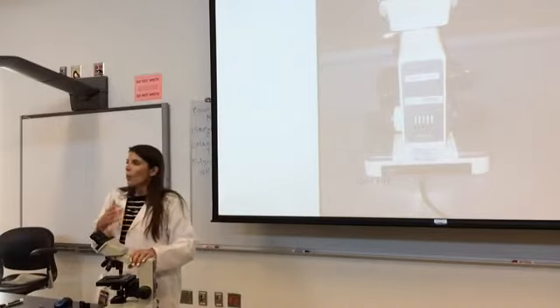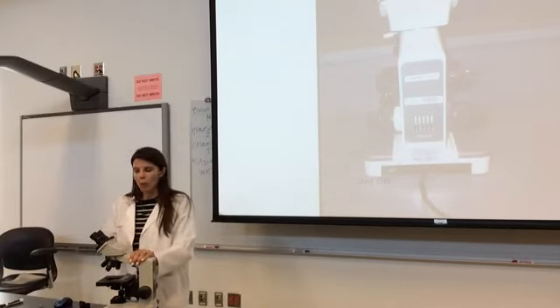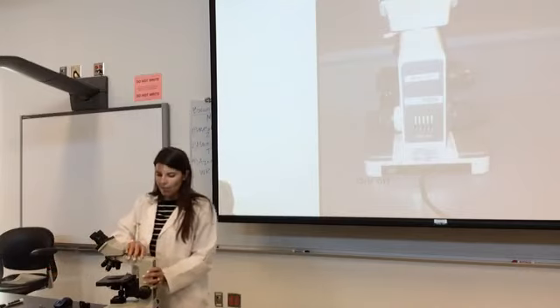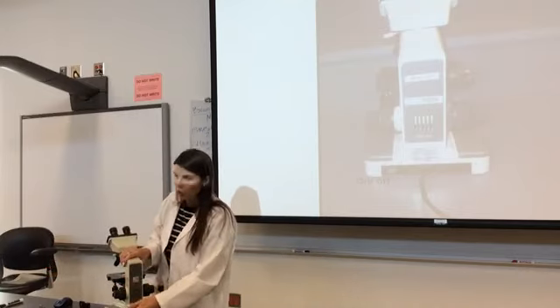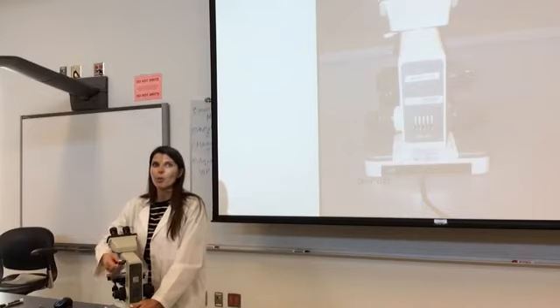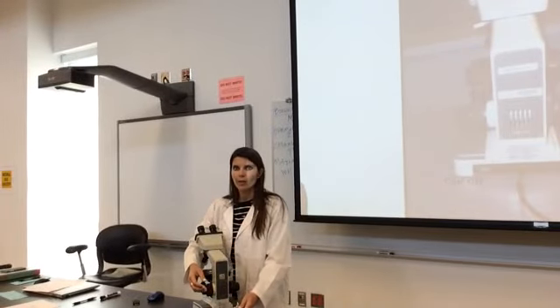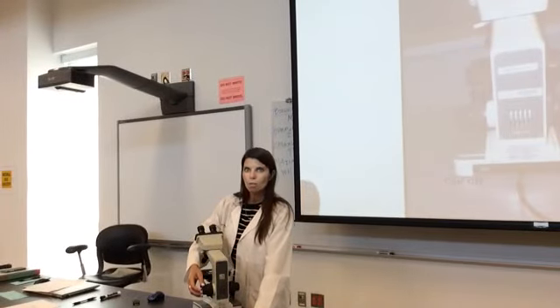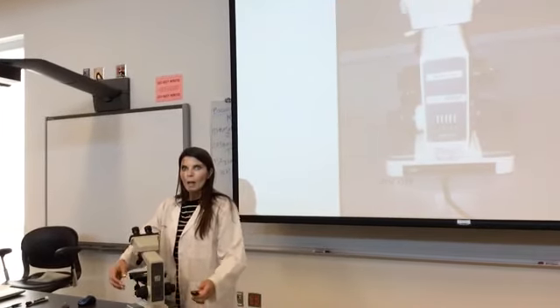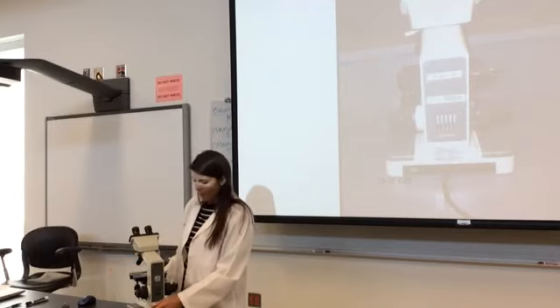When you come up here, a lot of students say, oh my gosh, the microscope isn't working, it won't turn on. You've plugged it in. The next thing you have to do is turn it on. There's an on-off switch at the back of the microscope, and just click that, and it should turn your microscope on.